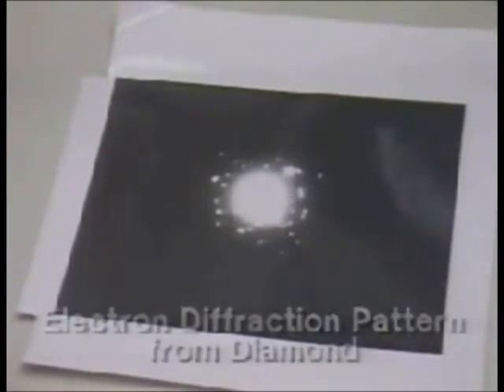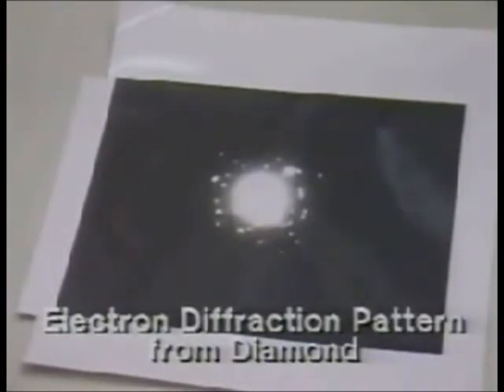these. Now, the diffraction patterns consist of rings, and one is able to index those rings to see which crystal type the crystal belongs. And in this case, we showed that they belong to the diamond cubic type, which was a good indication of the small crystals we were seeing in the films, in fact, being diamond.